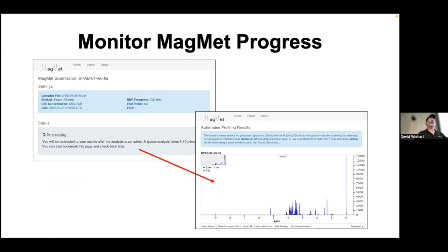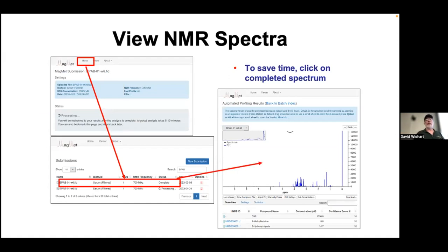Once you've uploaded your data, the computer starts the spectral deconvolution — going through each peak, picking them out, matching to things in the library, guessing and checking automatically. After about 8-10 minutes it'll produce an answer. During that time you can have a coffee or walk around. You'll get a result showing a fitted spectrum. You can view spectra in more detail, click on the spectrum, download it, and see a list of what's been processed and whether it's completed.